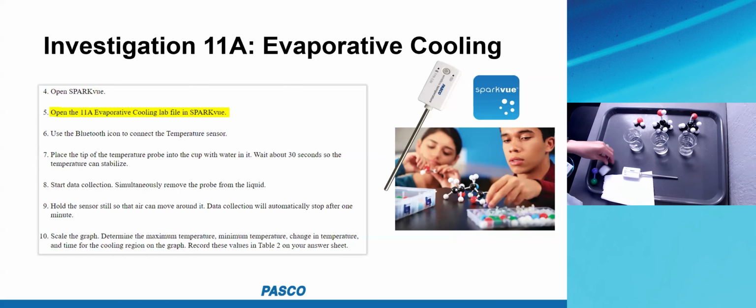But if you wanted to throw that in there, I suppose you could. It is the nail polish remover, so students might have experience with that. Hey, you ever use nail polish remover? What does that feel like? Oh, it's really cold. So they might have some experience there. So that's the first part of the lab.